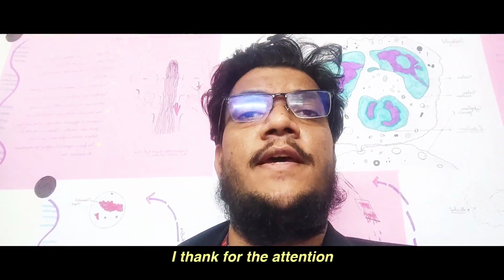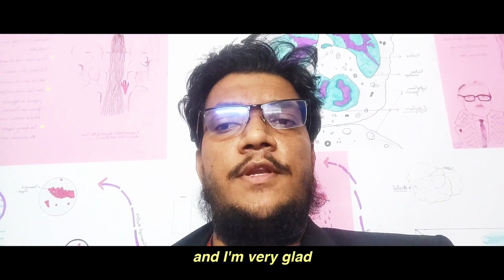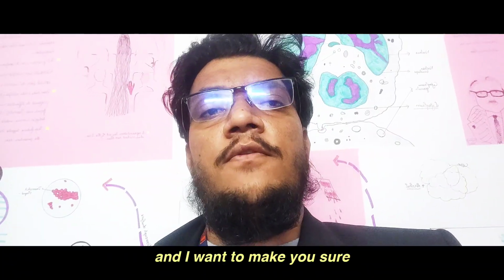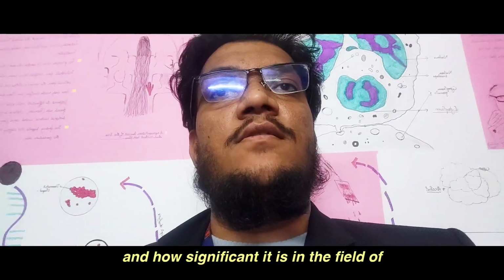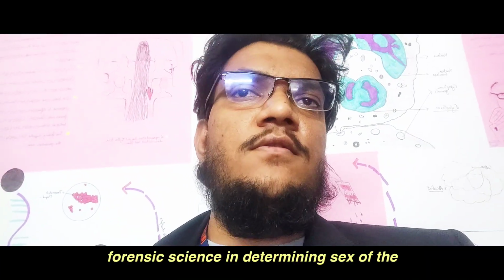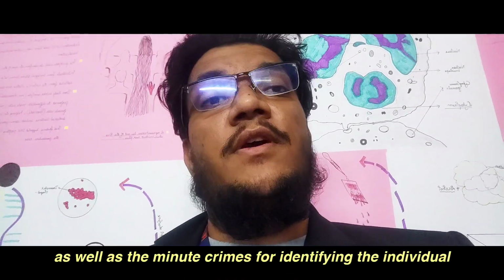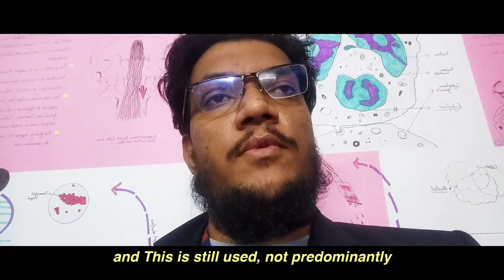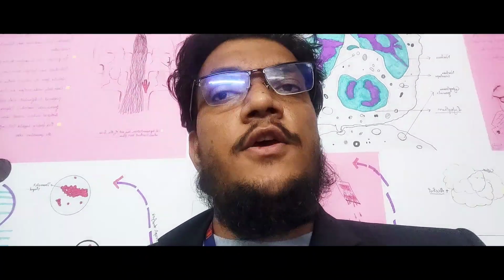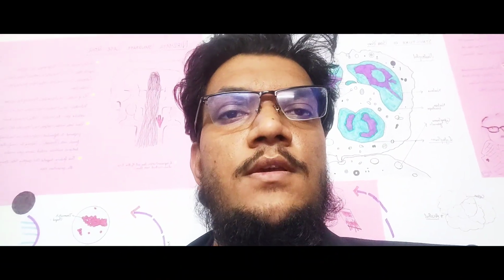I thank you for the attention during these 10 to 15 minutes of video, and I'm very glad that you have listened till now. I want to make sure that the Barr body is only seen in females, and how significant it is in the field of forensic science in determining the sex of individuals in very serious crimes as well as minor crimes. This is still used, not predominantly, but as an easy and quicker way to find the identity or sex of the individual from a crime. Thank you.